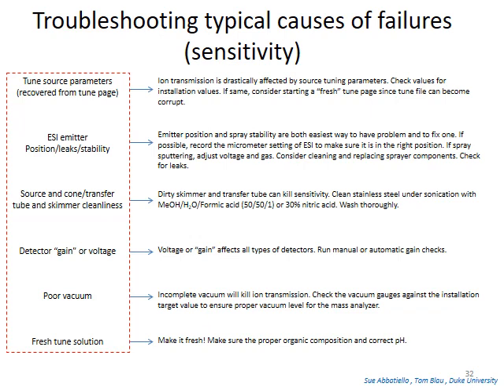For sensitivity issue, you can check the current tune file against the original tune file to ensure the settings are within the acceptable range. A corrupted file can happen. Using a new file may recover the sensitivity without any hardware troubleshooting.